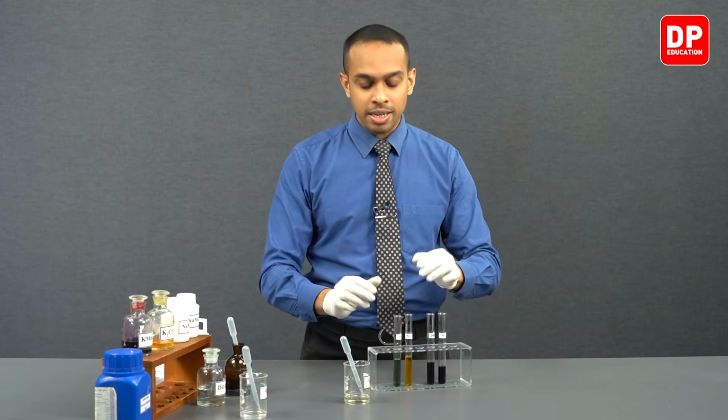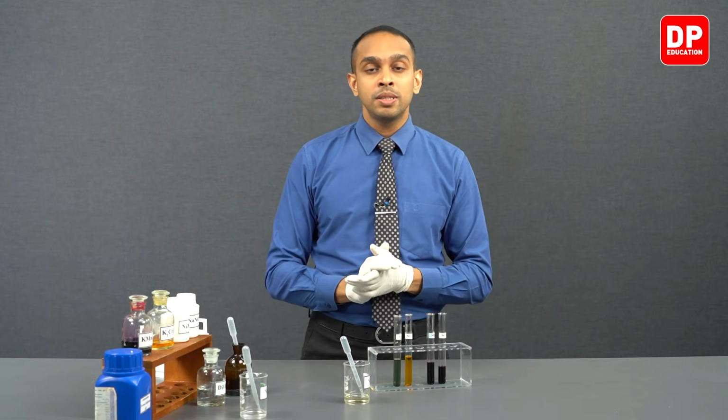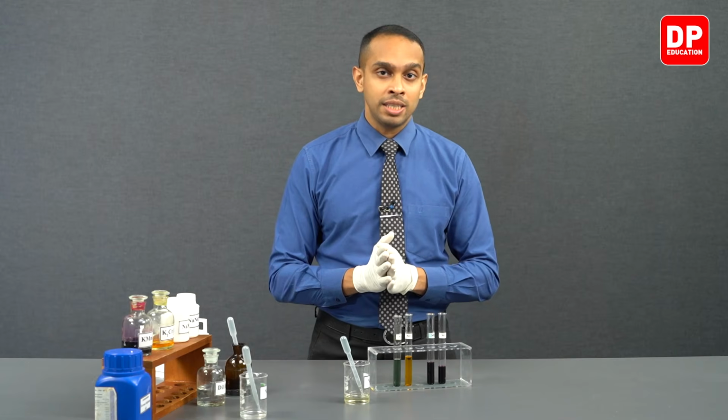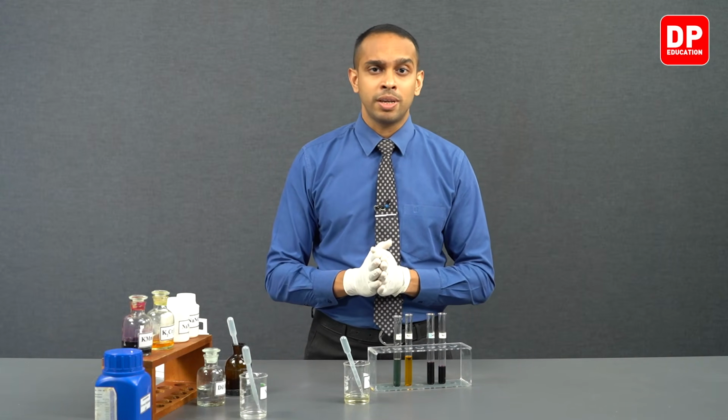What has happened here is when nitrite ions are present in the medium, they can get oxidized by a strong oxidizing agent such as acidified potassium dichromate.